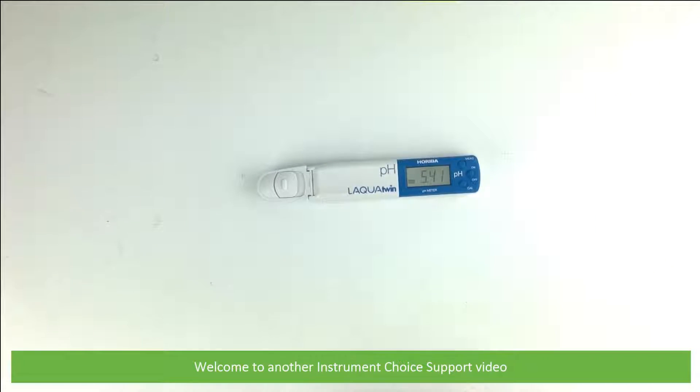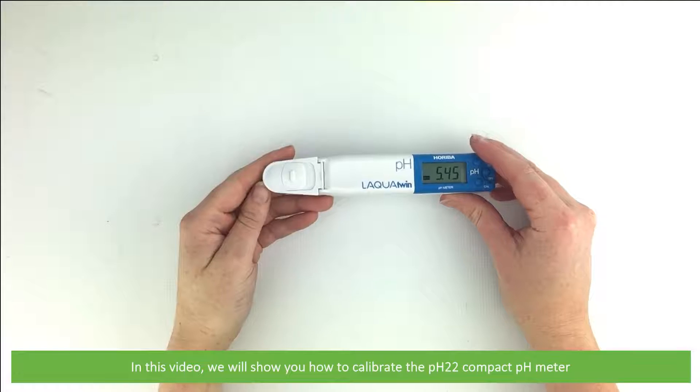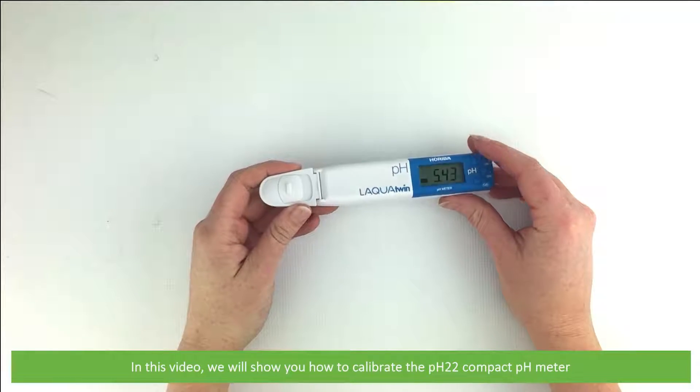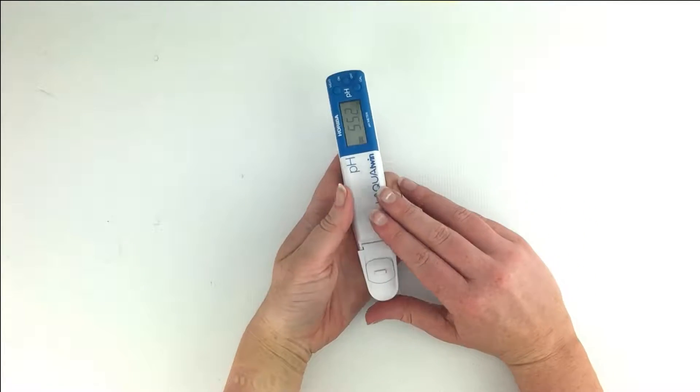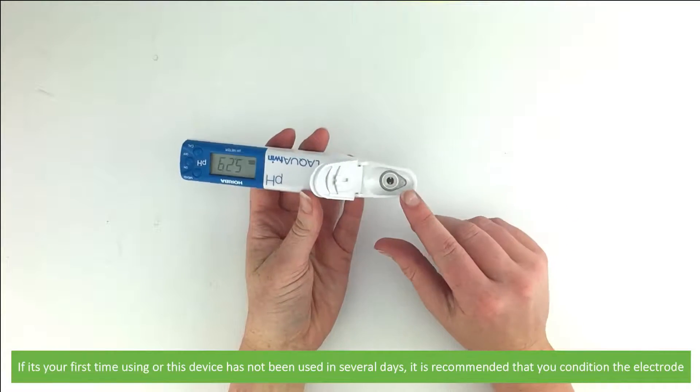Hi and welcome to another Instrument Choice support video. In this video we will show you how to calibrate the pH 22 compact pH meter. If it's your first time using it or this device has not been used in several days, it's recommended that you condition the electrode.